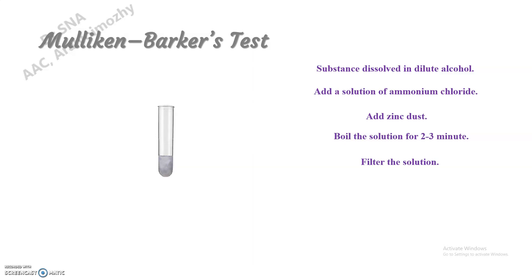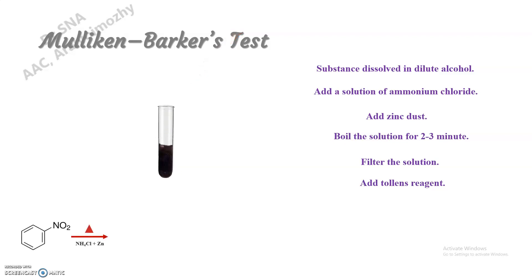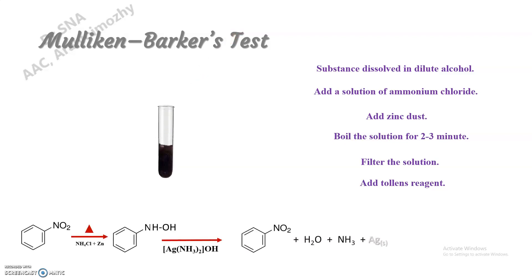To this filtrate, add Tollens reagent. Silver gets precipitated out, and the grey precipitate turns black. This indicates the presence of the nitro group.